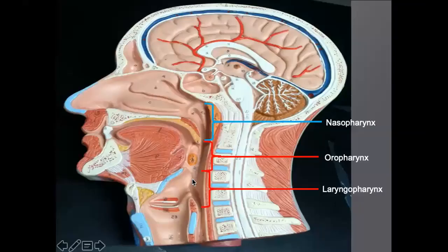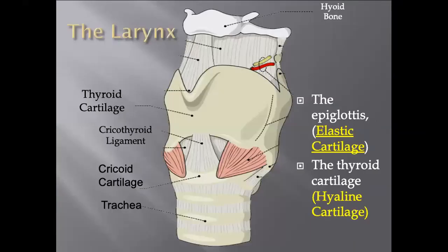That's exactly how this will be a question on the test as well. Use these brackets, and probably I'll just take this exact picture and remove the words and ask you to identify one of those regions. And it will say identify the region. All right. I had that. Oh, well, I was looking forward to try to see.